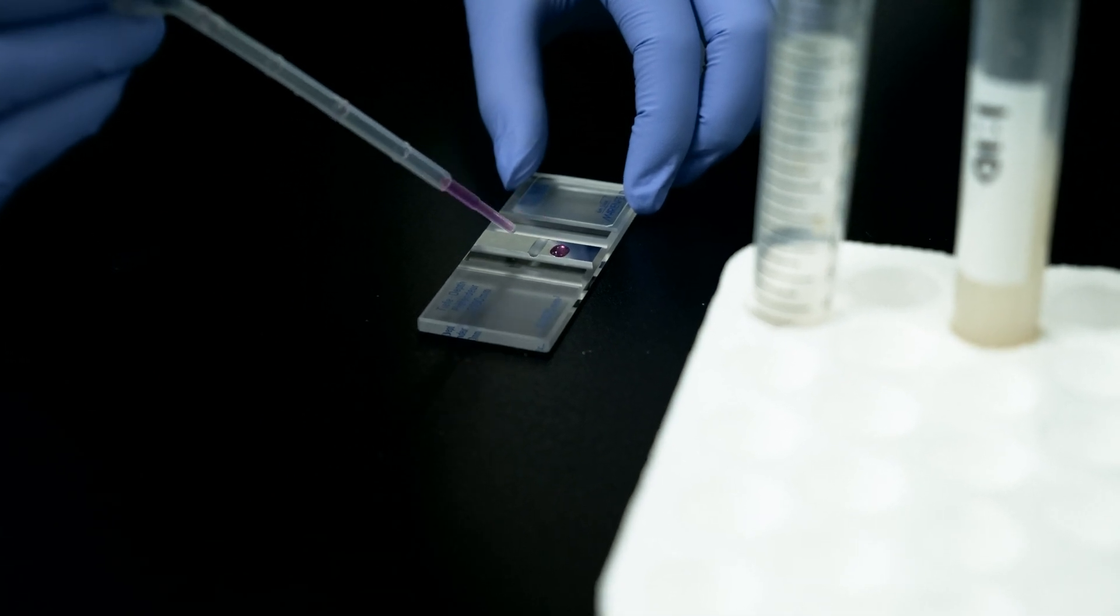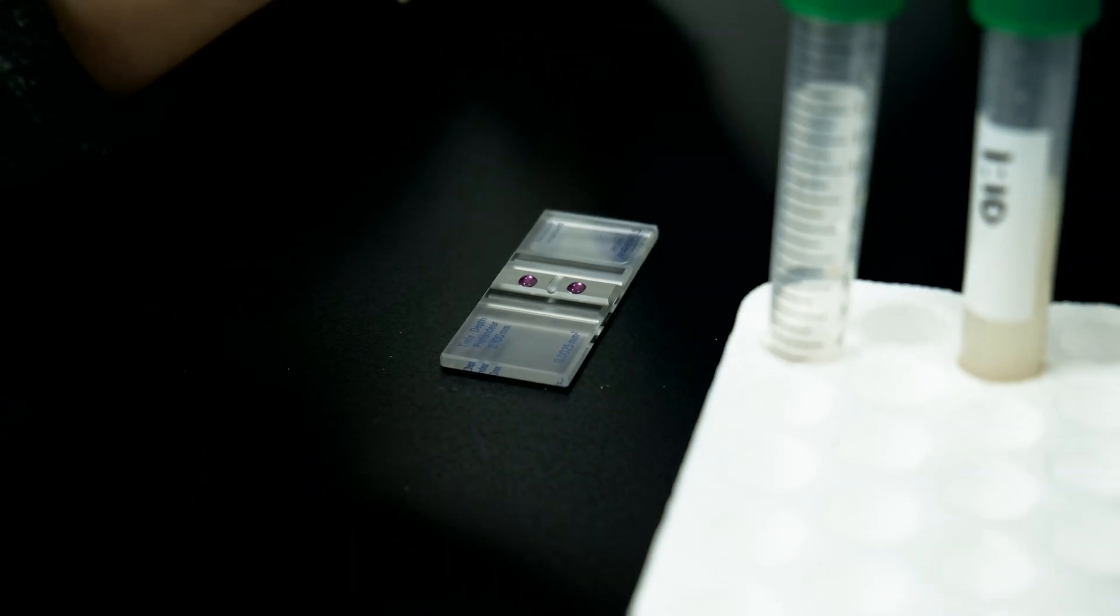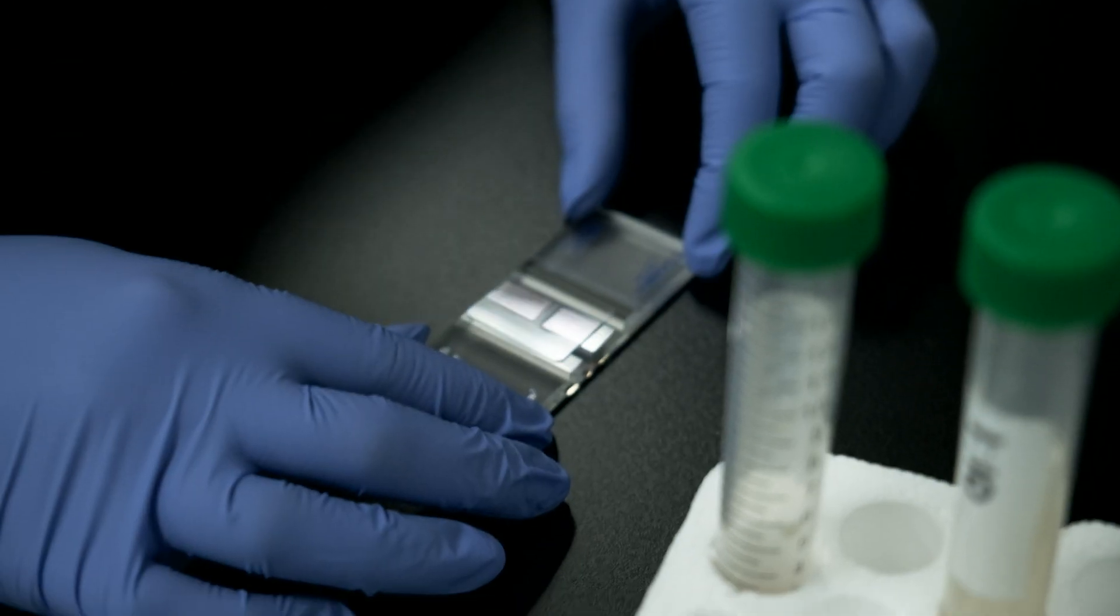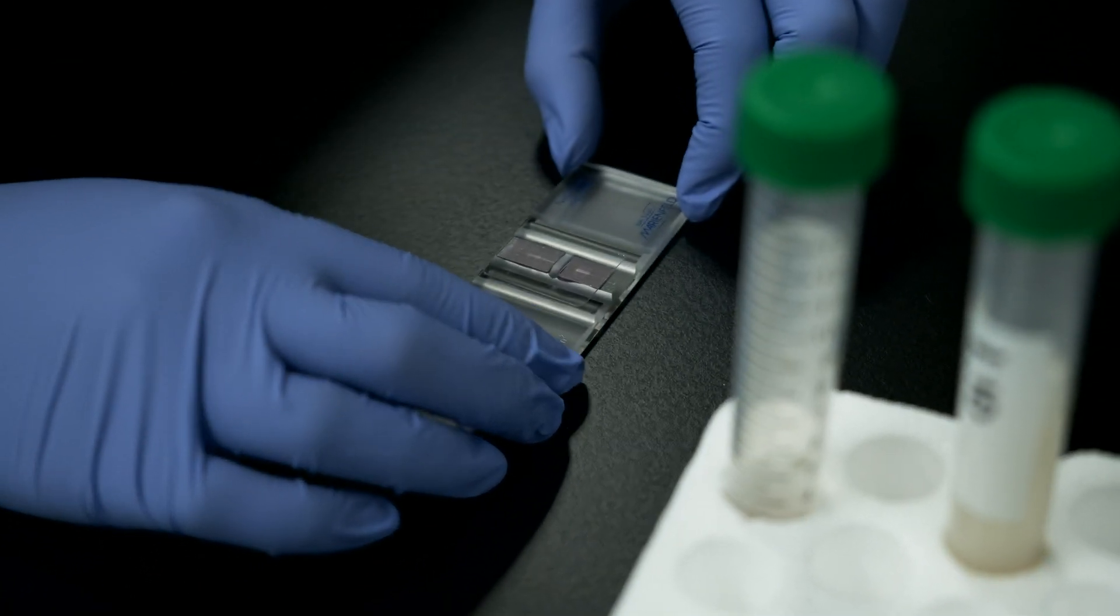Pipette approximately 10 microliters of your sample into the center of the counting area on your hemocytometer. Gently lay a cover slip over the sample without creating any air bubbles. If you're unable to measure 10 microliters, place a drop smaller than a pea.